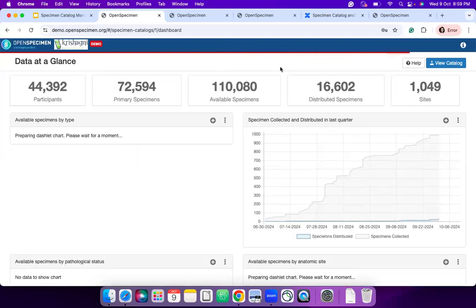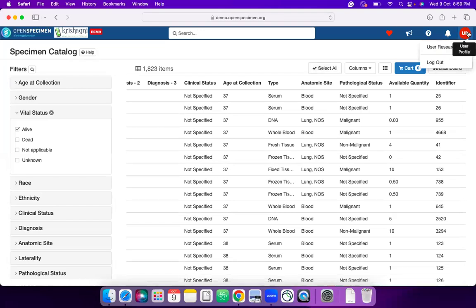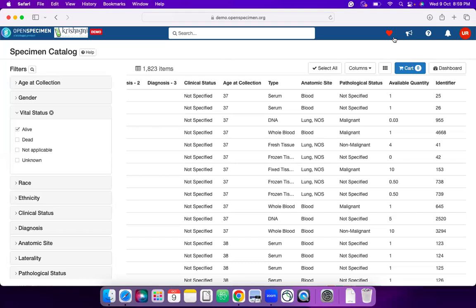Just 1 minute. Rohan, can you log in and quickly change this setting? It seems that I have logged myself out and there's no sign in button. Till then, I'll show you the researcher view.